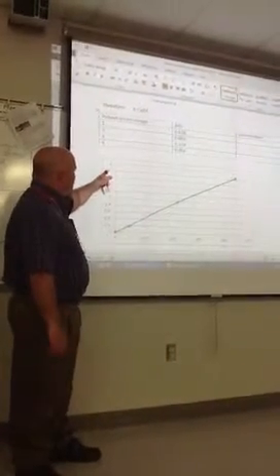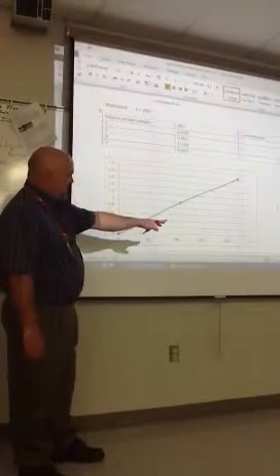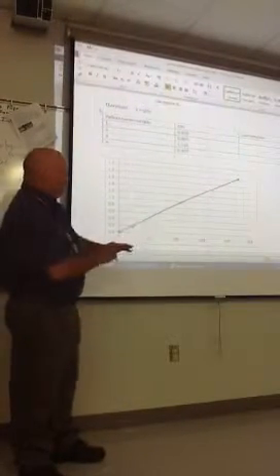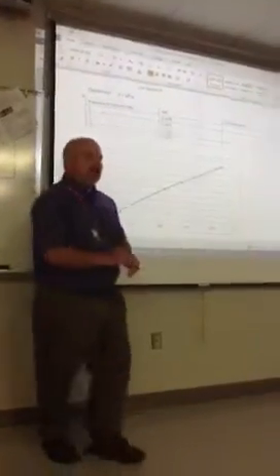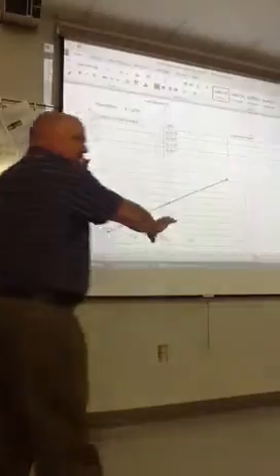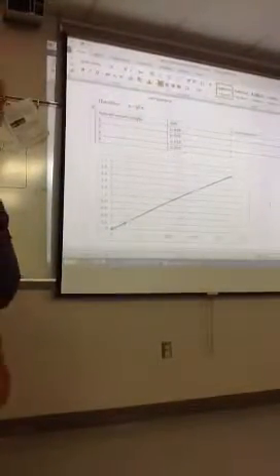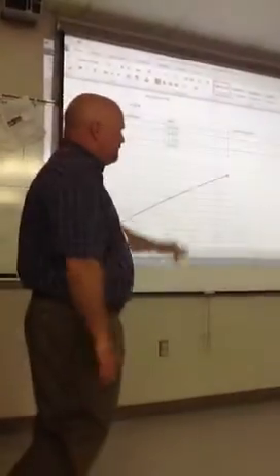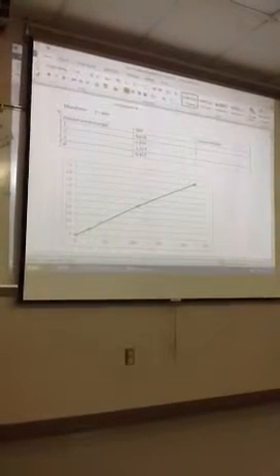If we were to run this up to 200 to make it equal, what we end up with is a line that's like this instead. So the slope is not actually that big, but for effect, to give us an indication of where things are at, we can do it this way. Okay, then I give you some patient samples. Once we have solved for the slope of that line at that wavelength, then we can go back and solve for as many unknowns as you might want.